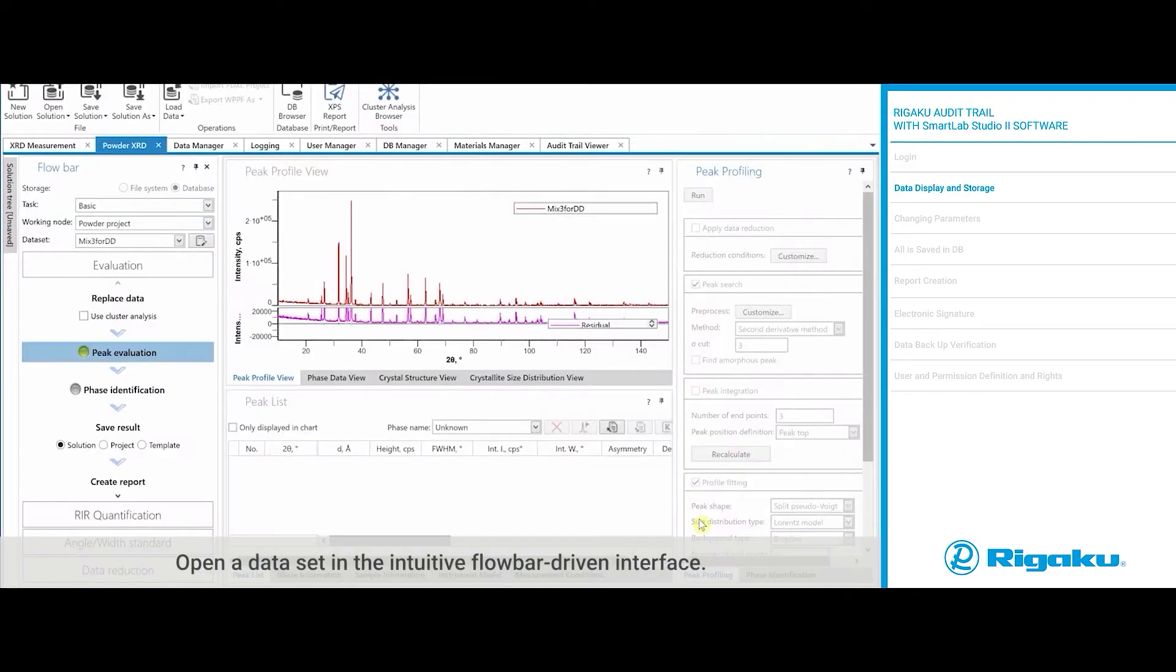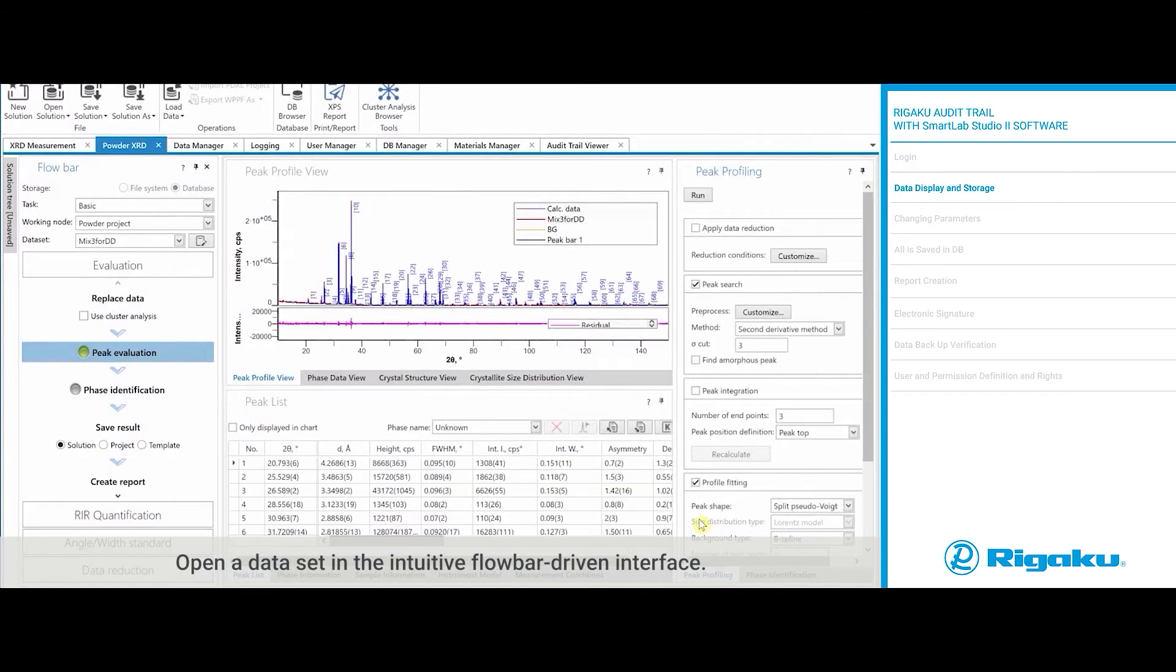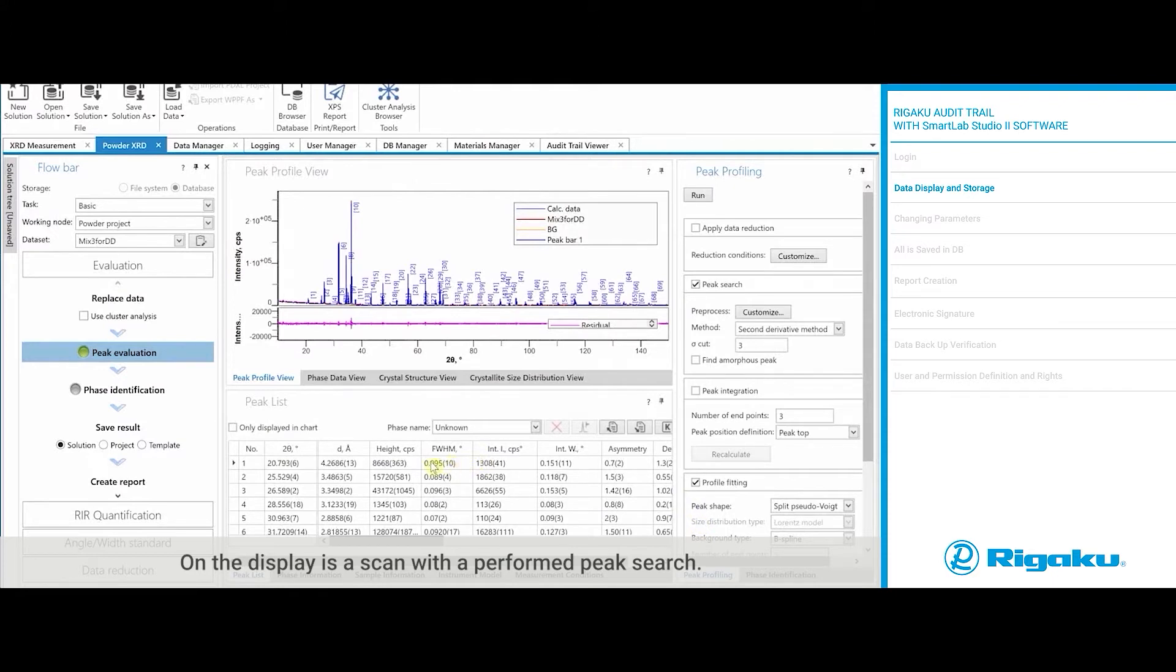Open a data set in the intuitive flow bar driven interface. On the display is a scan with a performed PEAK search. Review the PEAK parameters.